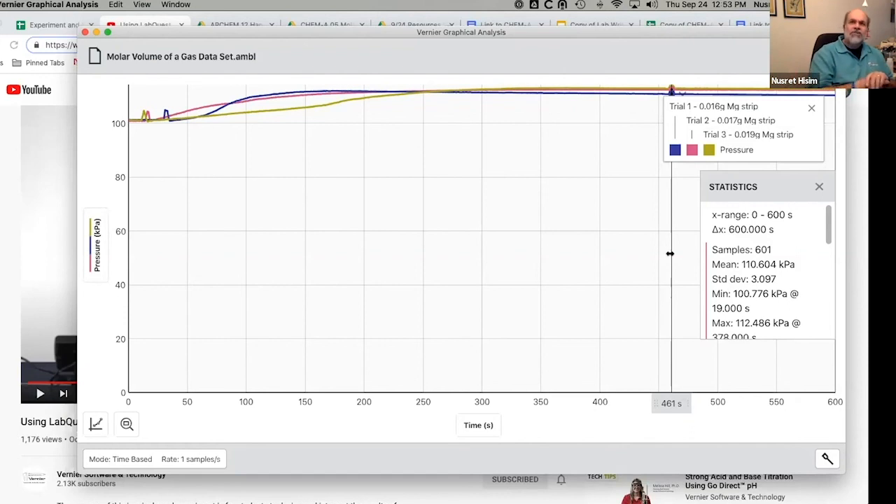We're looking at some other features in Graphical Analysis Pro — things that are missing from the free version that lots of people have been asking for. For most people, the free version works great for our lab manual experiments. But now that we're in this situation, wouldn't it be nice to link the Graphical Analysis file to a video and show it all together? That's why we developed Graphical Analysis Pro. Can I show it for the molar volume of a gas? I would love for you to do that.